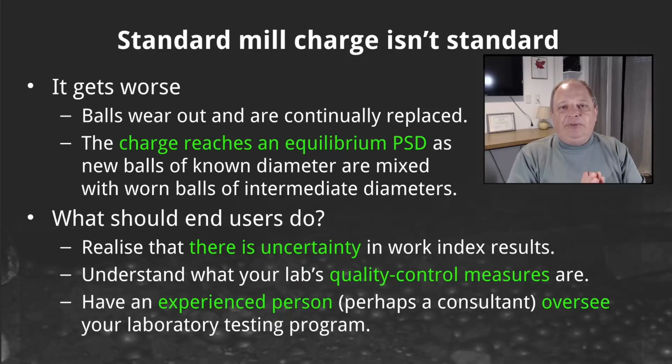So what you can do as an end user, you can build those sorts of quality control measures into your laboratory programs, whether it's an external lab or your internal labs. Also consider having an experienced person, right? I'm a consultant, this is what I do for a living, that oversees your laboratory program and can potentially catch some of these issues before you've run 100 samples that you've spent $1 million generating through the lab, only to find out that they didn't wear in their brand new ball mill properly.